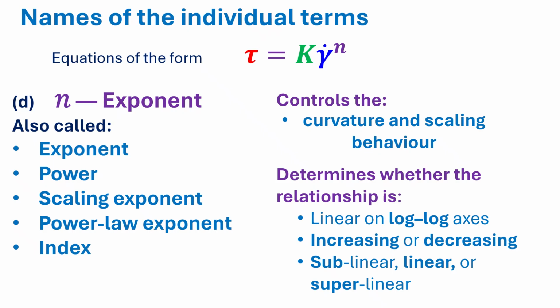This is really controlled by that n exponent value, and this is why we relate this to the power law, because it gives you a sense of what the curve is going to look like for a given value of n. When n is negative, it will actually decrease the graph. So again, these log-log plots are extremely useful when they give you these values of n.